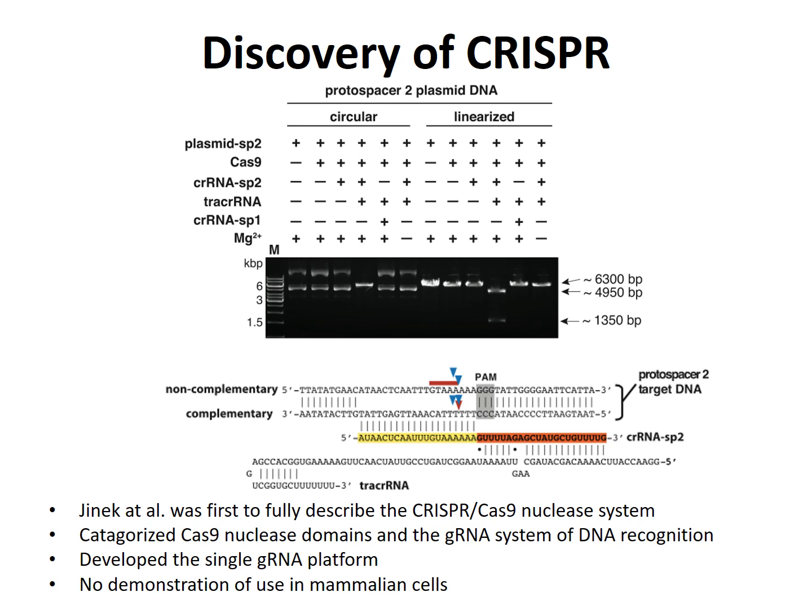about the CRISPR-Cas9 system. So they figured out that in nature, there's actually a 2 RNA system. One is called the tracrRNA, and so now this is what makes up the backbone of the single RNA system that we use today. And then to target its specific invading bacterial phage in nature, you have a sequence-specific portion, which we call the protospacer. So this is what identifies the DNA. And then there's a region that's complementary to the tracrRNA, such that it makes a complete guide RNA.